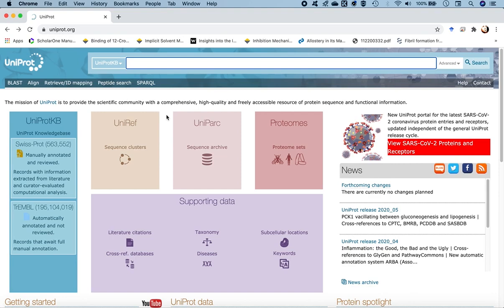So most of the structures in the crystallography method by crystallographers are obtained by resolving them in a water environment or using some crystal waters in order to obtain the structure. So, okay, let's go ahead and obtain the sequence, the primary sequence, the protein sequence for the dopamine D1 receptor first. So, as we type in here, dopamine D1 receptor, and then press enter.